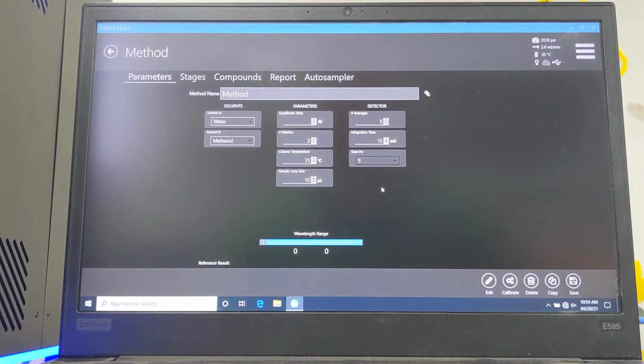They work the best. Down here, we have a slider bar to pick your wavelength, and we're going to click 254, and we're going to bring that one up to 254. If you wanted to do a window, say you wanted to look at several different wavelengths, you can actually open that up and look at several different wavelengths at the exact same time. But we're going to do 254. That's all I really care about.